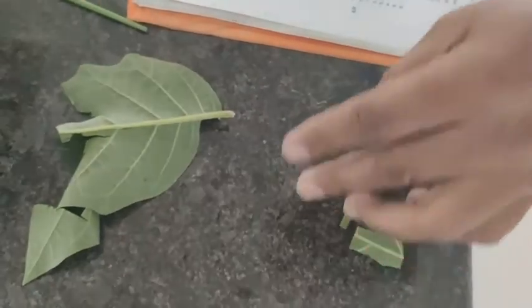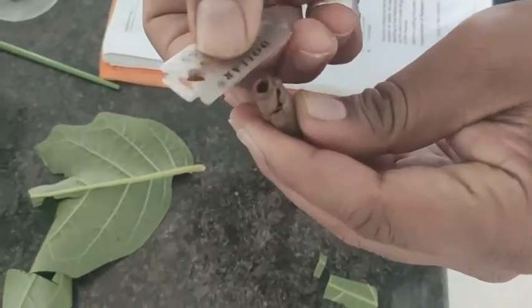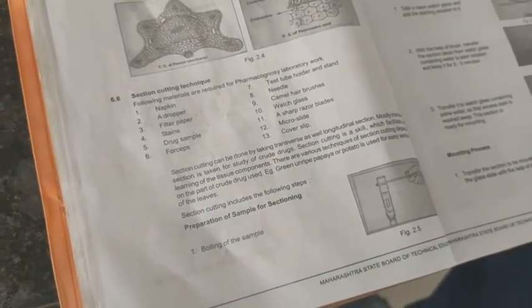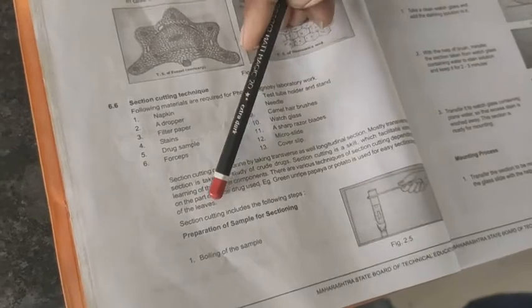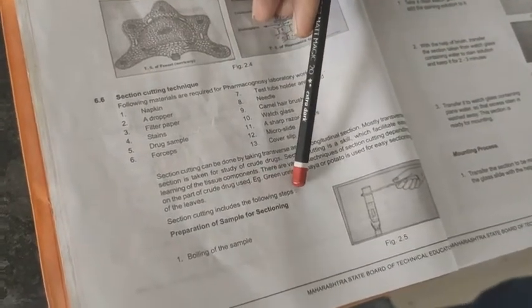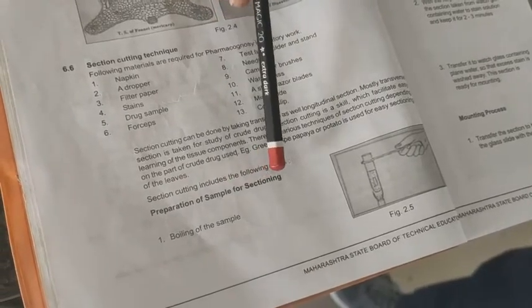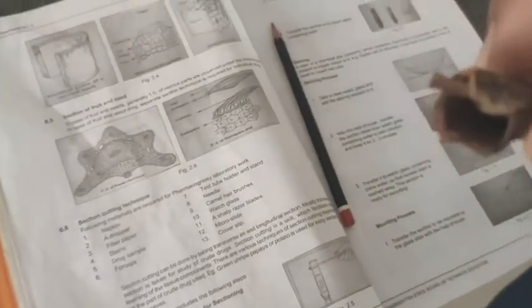Next is your bark. This you cannot cut easily because it is very hard. Therefore, for the technique, our aim is to see section cutting techniques. Section cutting includes the following steps. The first one is the preparation of the sample for section cutting. This is very hard, yes or no? Nobody can cut it easily.